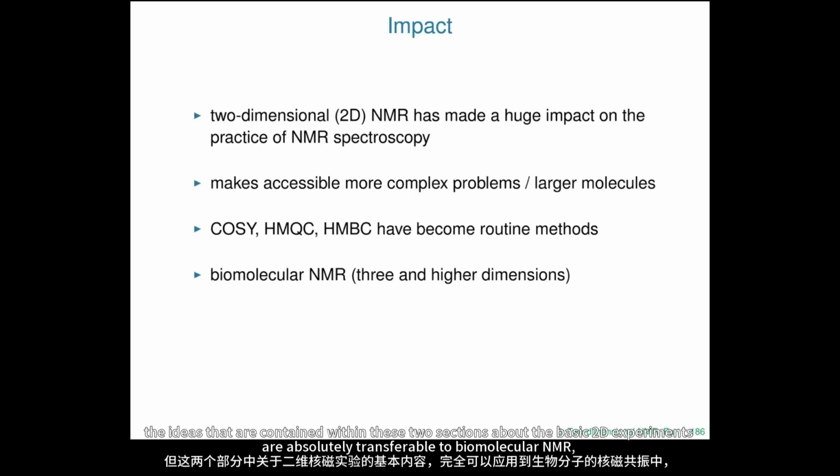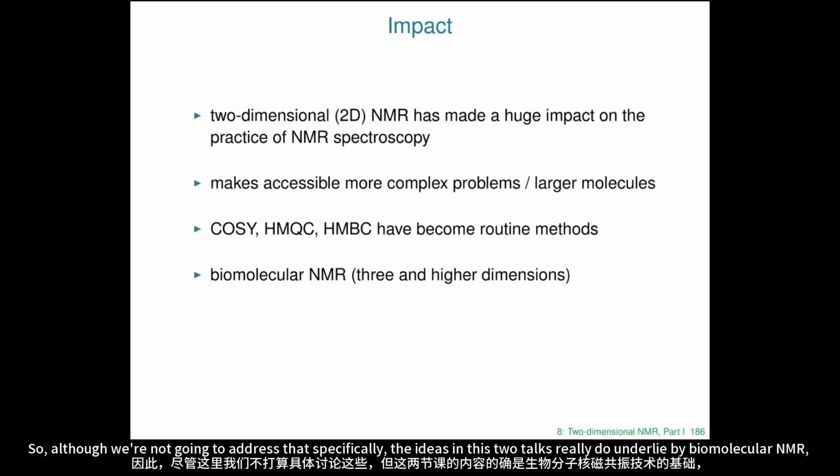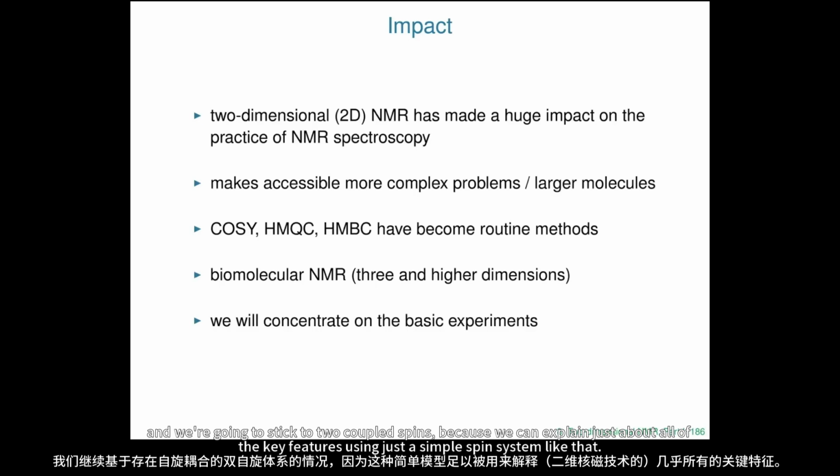Now, although we're not going to specifically talk about biomolecular NMR, the ideas that are contained within these two sections about the basic 2D experiments are absolutely transferable to biomolecular NMR. And all the stuff that they do with higher dimensions, 3 and 4 dimensions, it really is based very much on working out the same ideas. So although we're not going to address that specifically, the ideas in these two talks really do underlie biomolecular NMR. But we're going to concentrate on the basic experiments, COSY, HMQC, HMBC, things like that. And we're going to stick to two coupled spins because we can explain just about all of the key features using just a simple spin system like that.